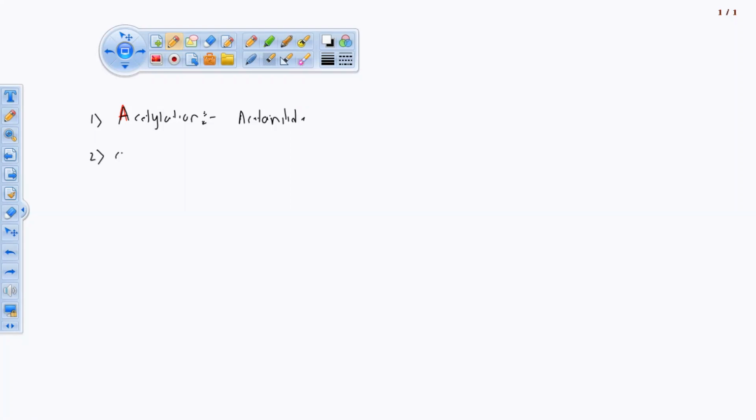Next we have done the condensation process, condensation without using any kind of catalyst. Condensation reactions are those reactions in which two molecules can be clubbed together to make one drug molecule. So that method is called the condensation method. In this methodology, in the condensation reaction, we have done the synthesis of benzimidazole. हम यहाँ पे क्या किए, synthesis of benzimidazole. ये किया हम लोगों ने, we have done the benzimidazole synthesis.